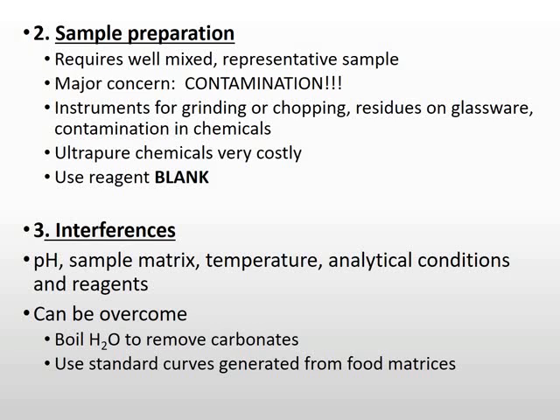Remember, we said you separate and then you analyze. But obviously, before you do everything else, there must be sample prep, because you might be analyzing your minerals from, let's say, a meat product, or from fruits, or from a powder in a big silo somewhere in a warehouse.